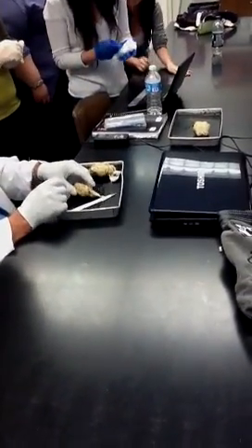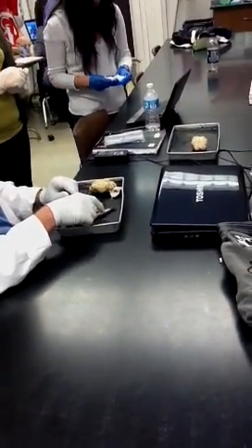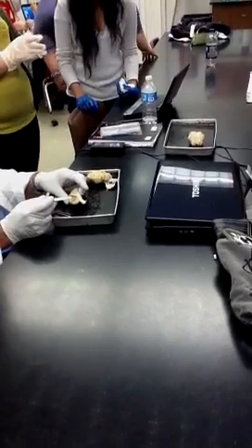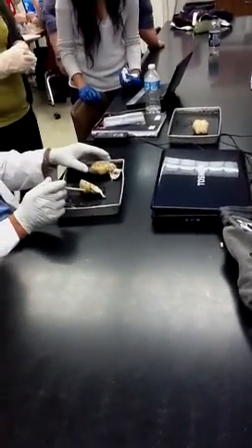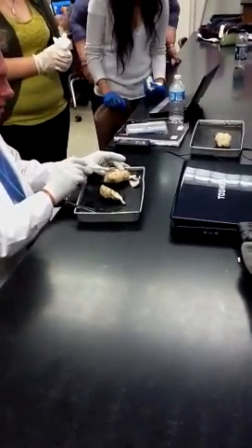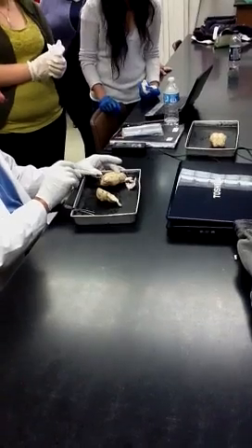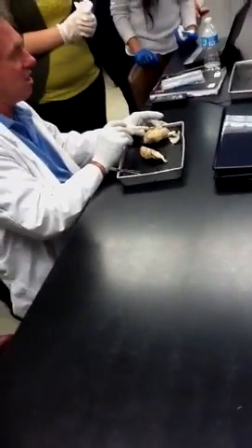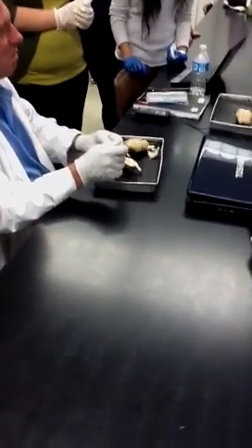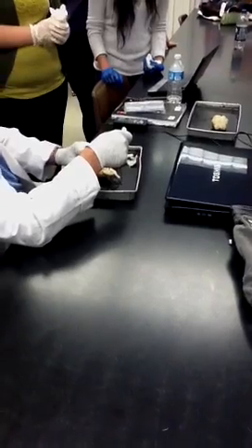So, what about the aqueduct? The aqueduct on this one's not so good. It runs right through there. Whoever cut this brain, I probably wouldn't have done it any better. It's hard to do with a small knife. If you're trying to cut right down the center, if you get slightly off one side or the other, then you kind of miss it. There's probably the other half of this brain under someplace that will show the cerebral aqueduct better.